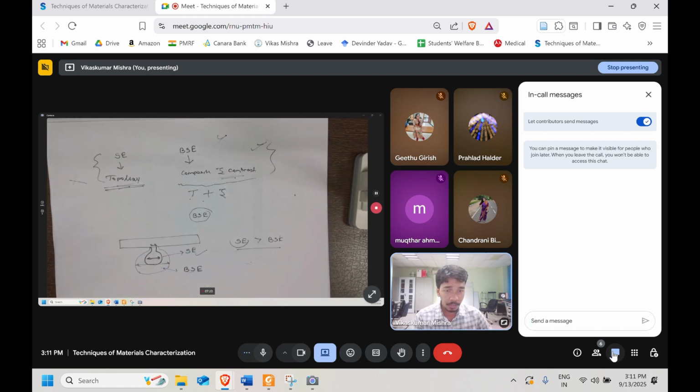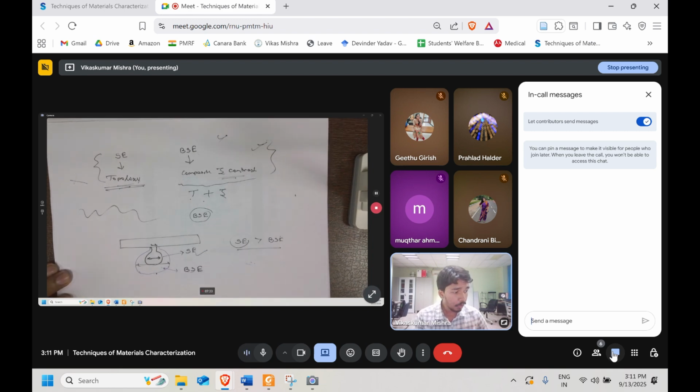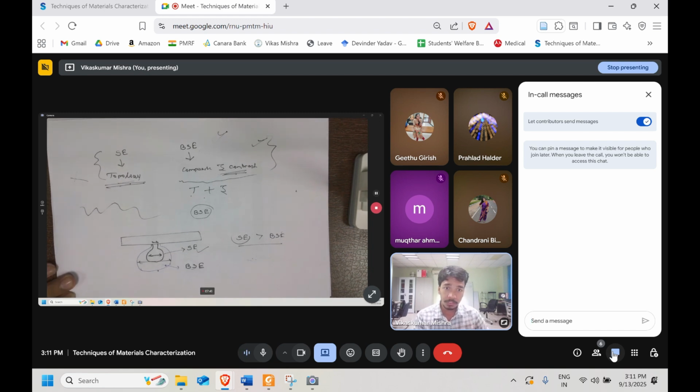So again, let's say you are doing fractography. You know the resolution in the BSE is not good. If your sample is very rough and you are going for the BSE and you want to do the Z contrast, it's not preferred. You won't be able to get information which you can trust 100% or even 90%. Okay, now this was the entire thing.